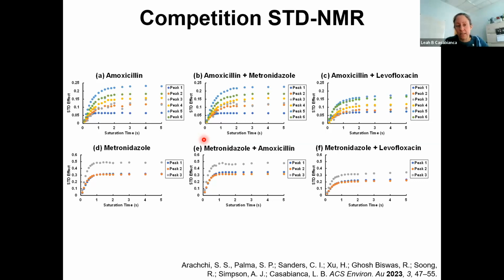On the other hand, when we added levofloxacin to a sample of either amoxicillin or metronidazole with the polystyrene beads, we saw a decrease in the STD buildup curve of both of these antibiotics. So this indicates that the levofloxacin is outcompeting the amoxicillin or the metronidazole for binding sites to these polystyrene nanoparticles.